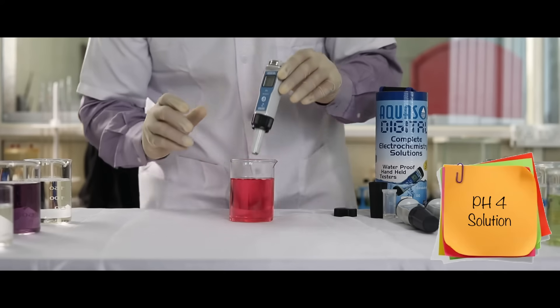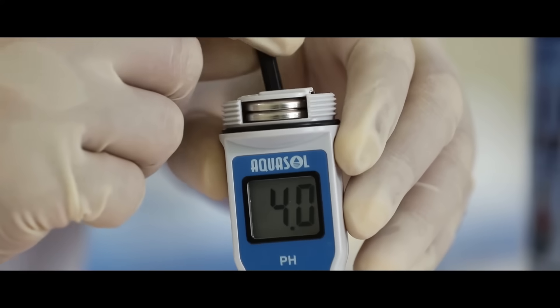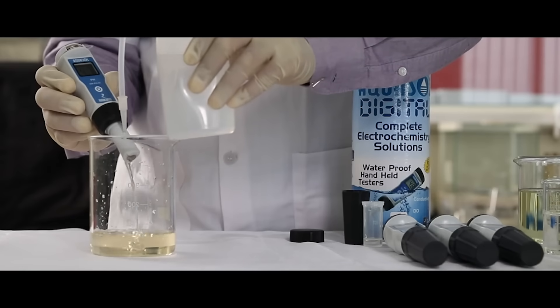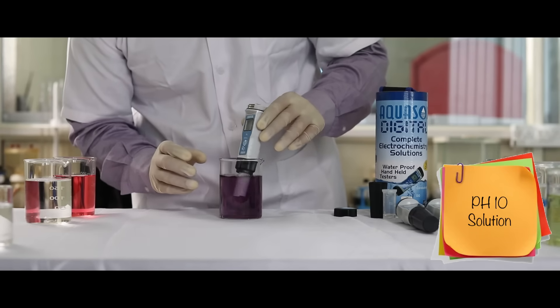Dip the electrode in the standard pH4 buffer solution. Using the span screw, adjust the pH value to the standard value of the solution. Repeat the procedure for the pH10 buffer solution.